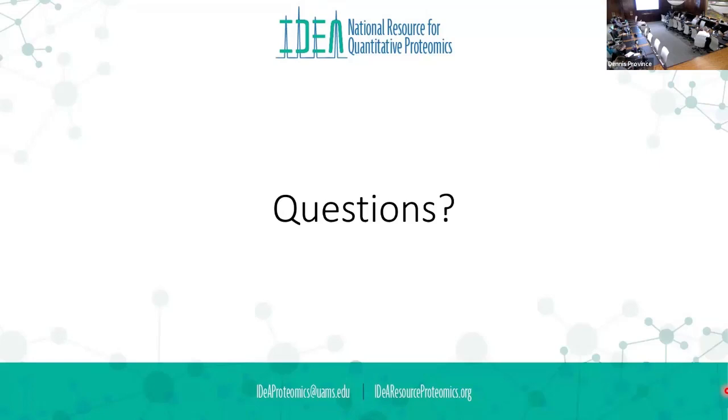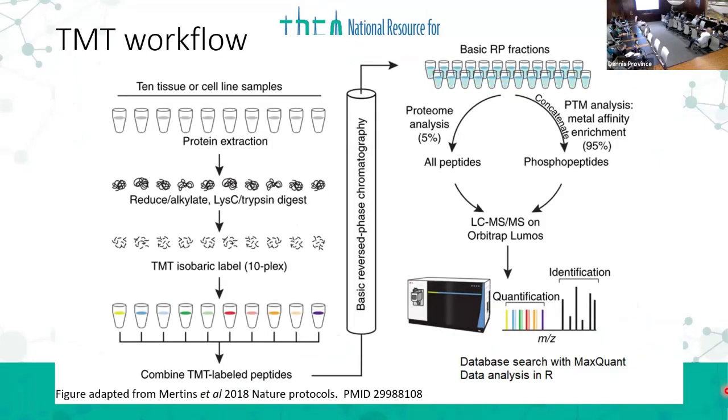Other questions? All right. You said you had some more slides. I do. I've got a couple of slides on fractionation. We've talked about this, but haven't gone into a lot of detail. So I just wanted to talk a little bit about how we're separating these peptides before we do the TMT.